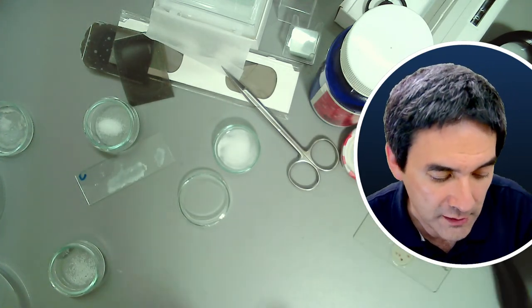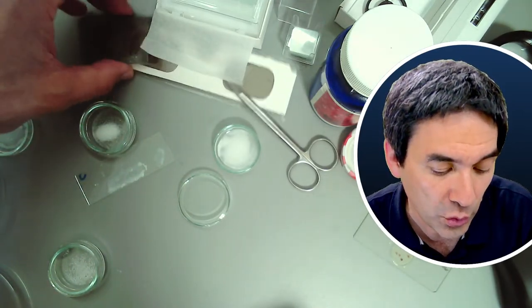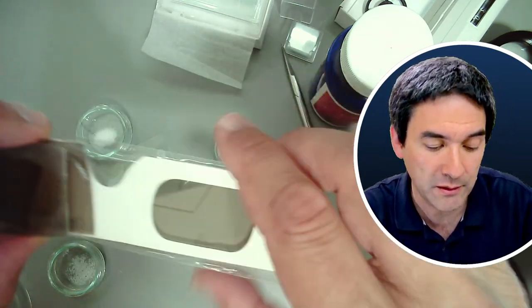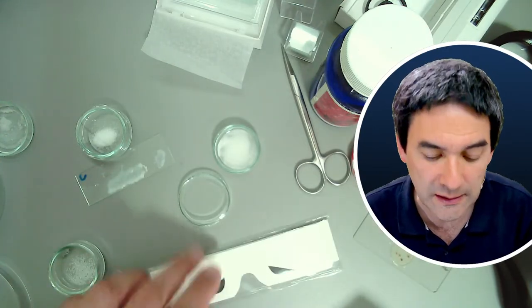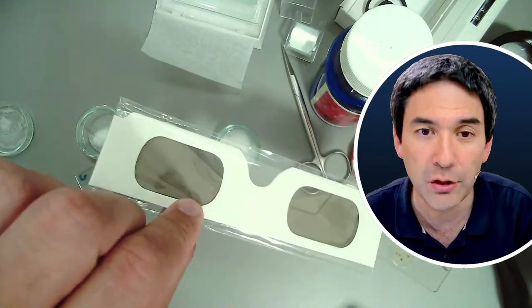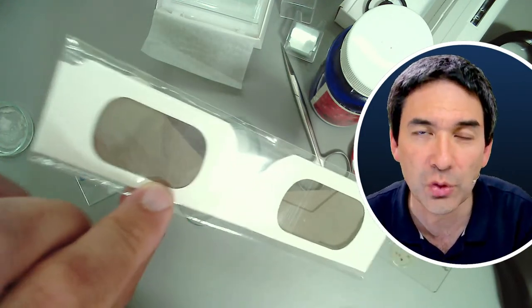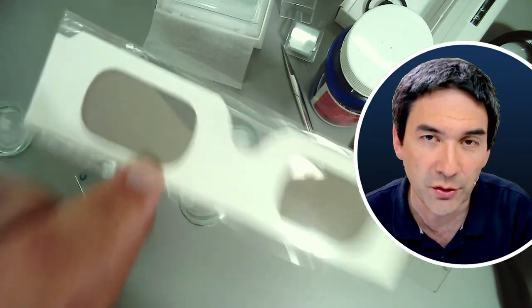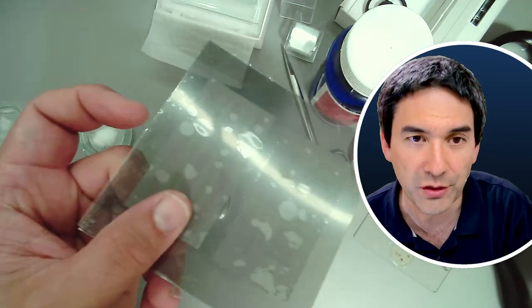And while it dissolves, before I forget, I wanted to show you another source of polarizing filters, but they might not work, okay? You know those 3D glasses. They're pretty cheap and I bought a lot of them, and they also have polarizing filters, but these are so-called circular polarizing filters and not linear polarizing filters. So those are different from those here, okay?